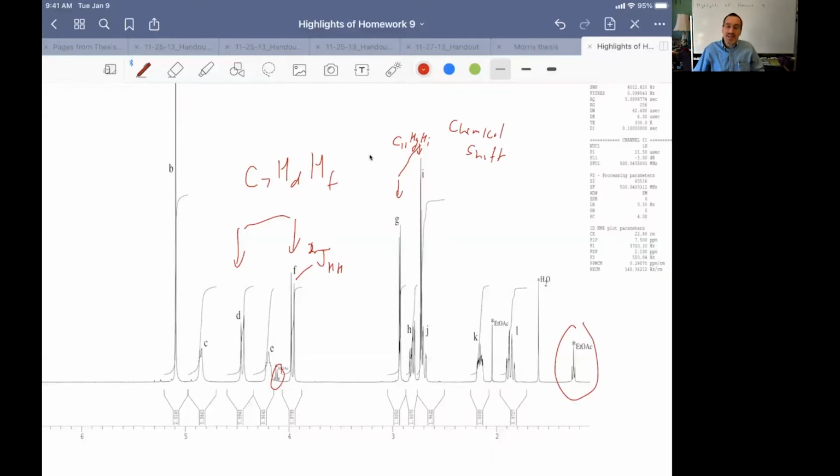The other thing is, look at the 2JHH. Very, very different. Look at how small that is, particularly when it's compared to this other isolated methylene group. And so it's like, oh, that's really interesting. Why is this isolated methylene group so darn different than this other isolated methylene group?